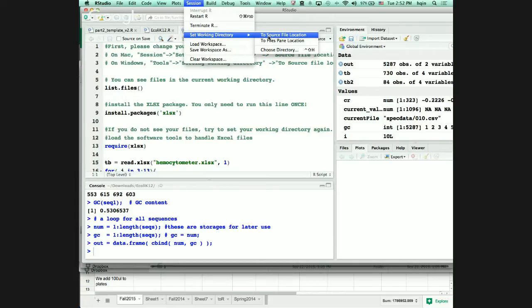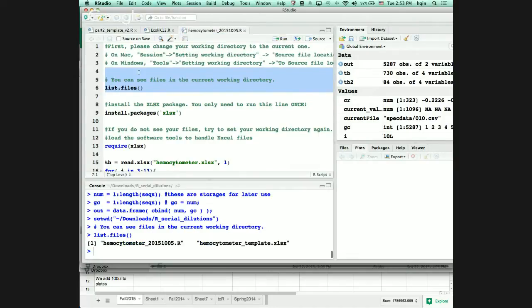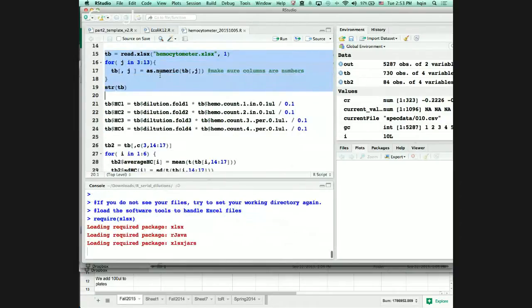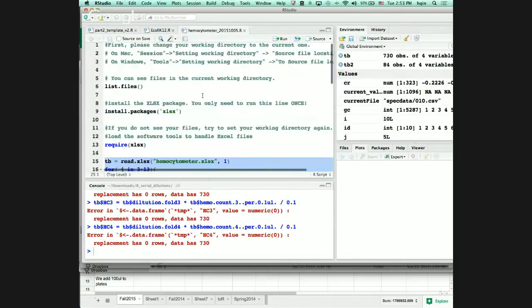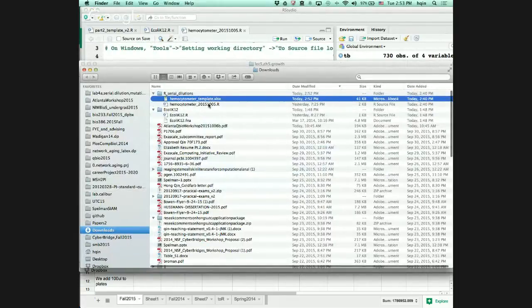You have to wait a second. Okay, once you are getting that done, Brianna, can you help Kenny? She has some problem to install. So once you get that done, we can just read that data directly into R, read that Excel file into R, and you just run those code. Oh, something is not right.